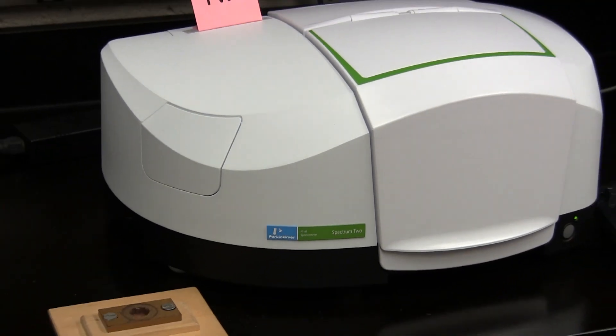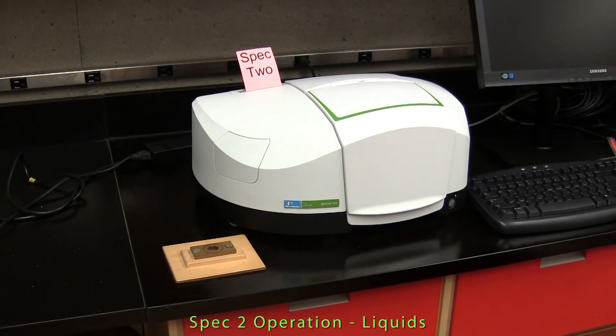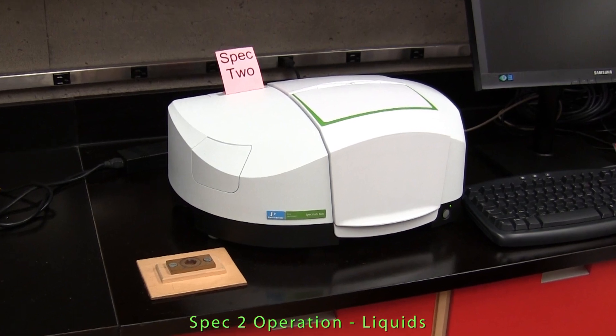Here we see SPEC 2 which you will use only to obtain IR spectra of liquids. Although we could also utilize a solid sampling method with SPEC 2, it will be used only for collection of liquid spectra.